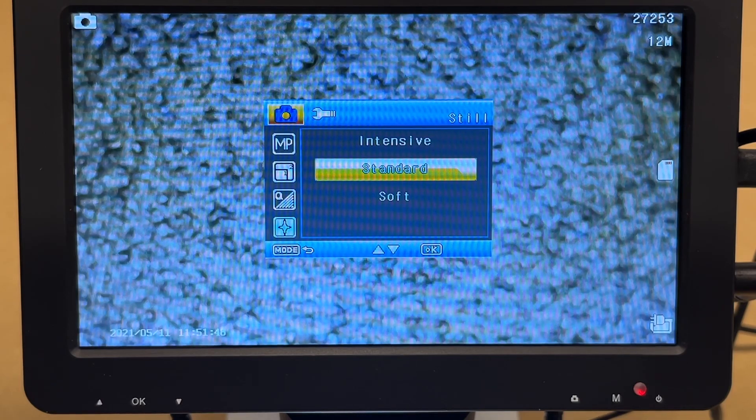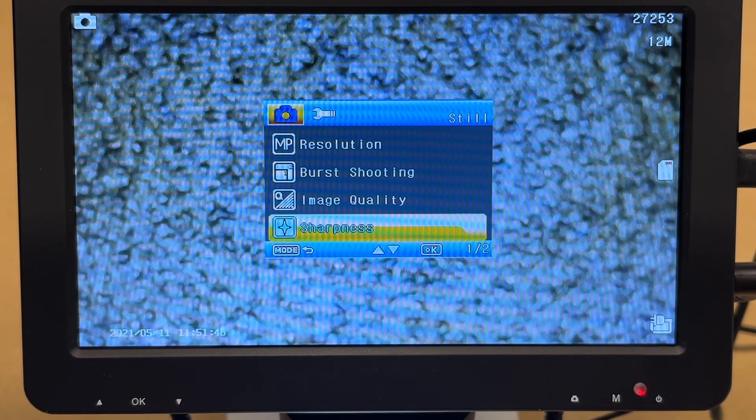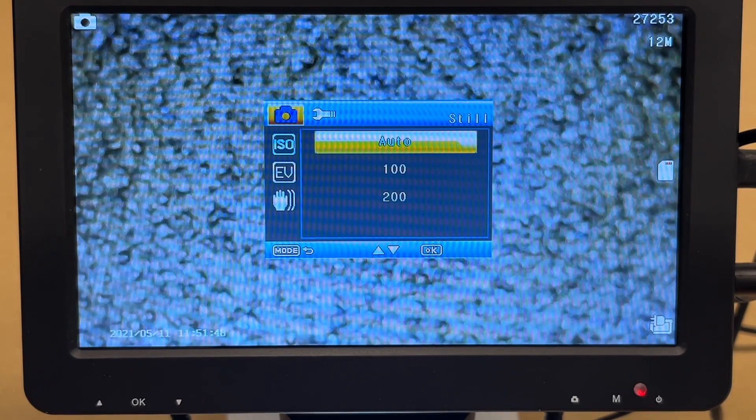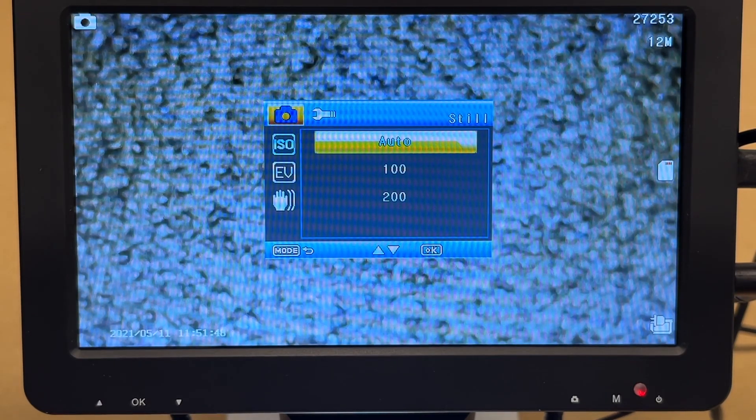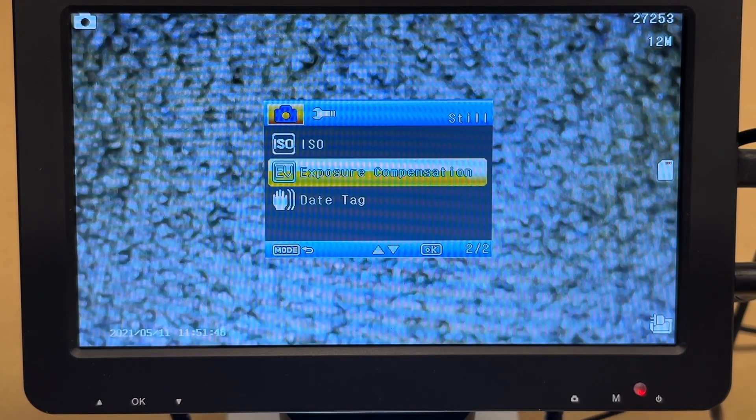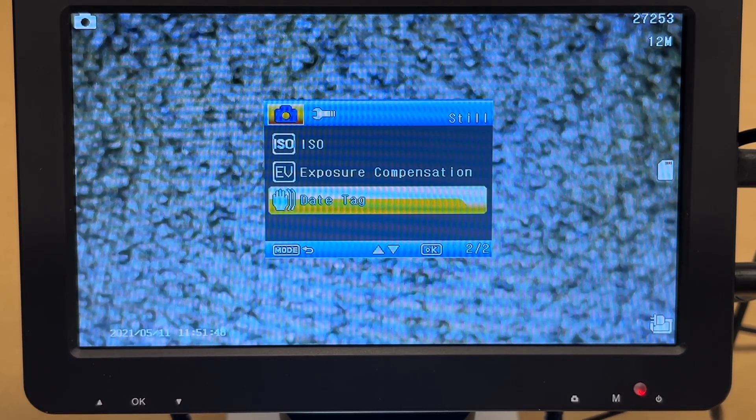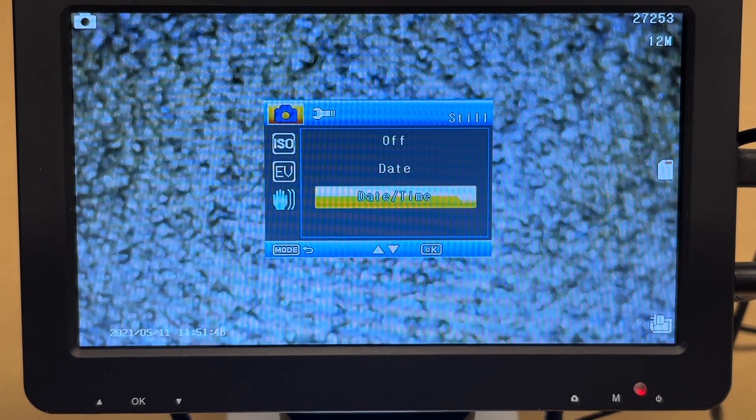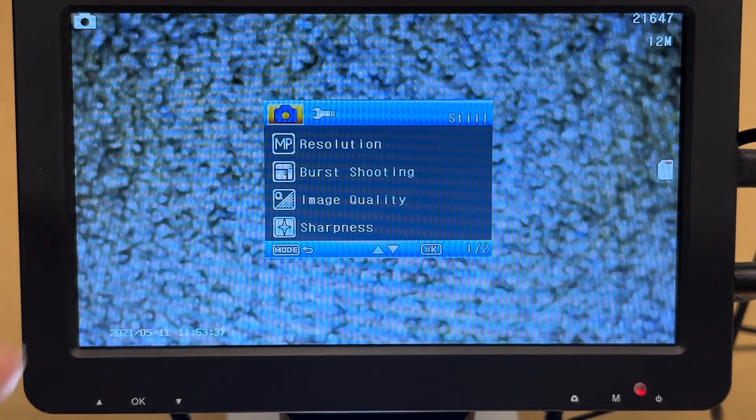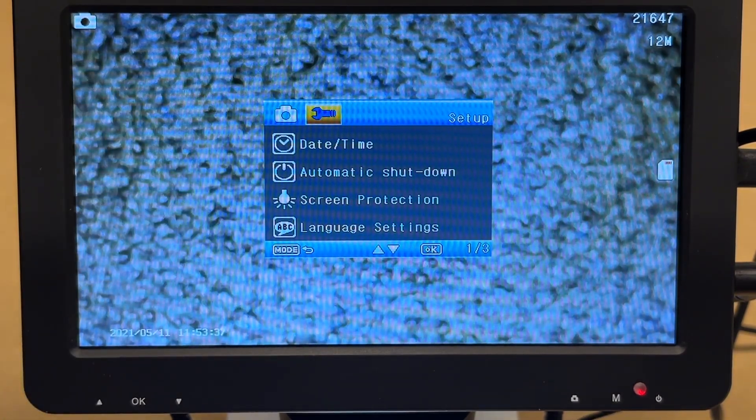Next we have sharpness: intensive, standard, or soft. I'll leave it on standard. ISO: auto, 100 to 200. Leave that. Exposure compensation here. So I'll just leave that as the default. And we have date tag: off, date, or date time.